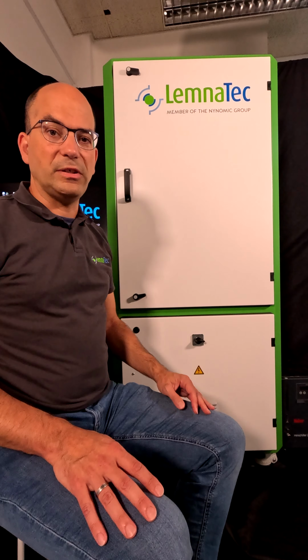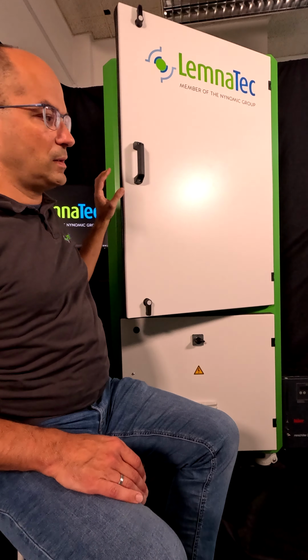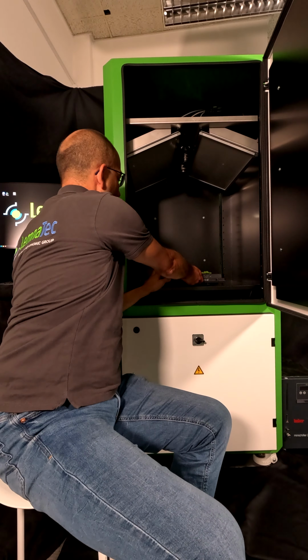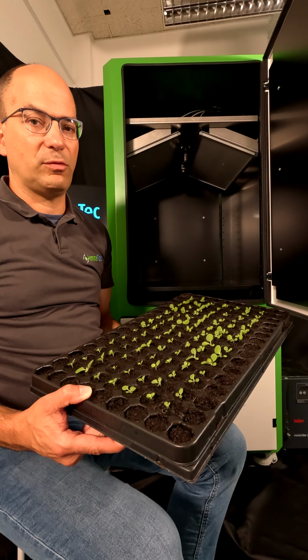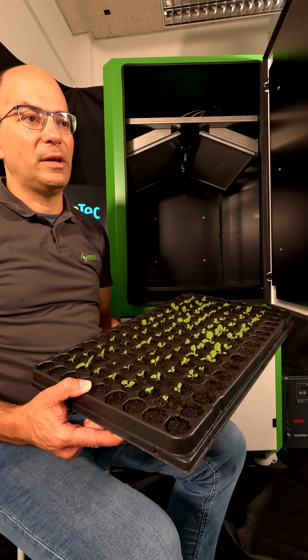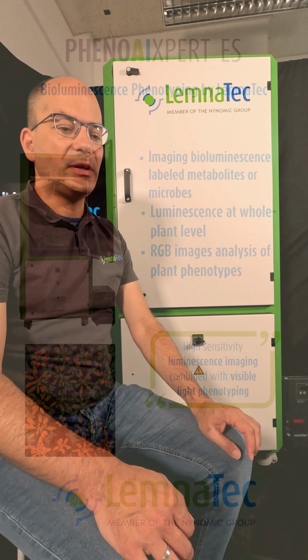When image recording is finished, we can take out the samples and now the system is ready for the next recording. So we could insert a new sample and start the recording process again. The images that have been recorded with the system can be processed in the LemnaTec software. Thereby, image analysis can be used to do classical phenotyping, so measuring sizes of the plants, and it can be used to analyze the luminescence.